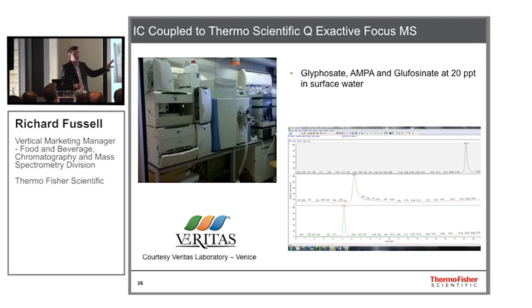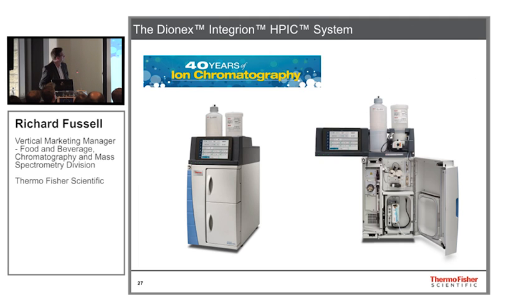And in the case of water, you could even do a concentration. You could put a concentration cartridge in the system before the guard column, and then you can get really low limits of detection. We can't do that with QuPPe methods because the formic acid tends to cause a few issues with trying to do the concentration. And the formic acid is the reason why we did the 1 in 10 dilution before. Fera found that they got better peak shapes by diluting, injecting 100 microliters rather than injecting 10 microliters of the QuPPe extract with formic acid. So the systems are robust and very well developed.